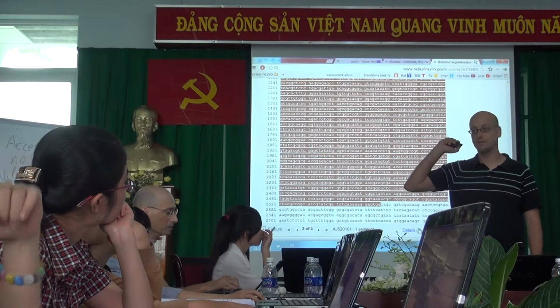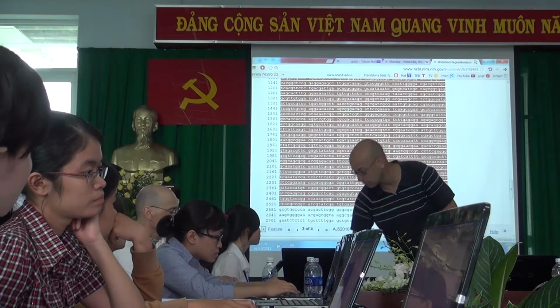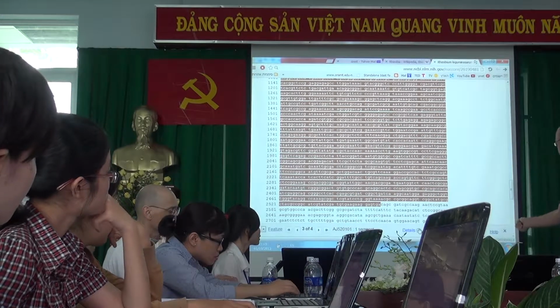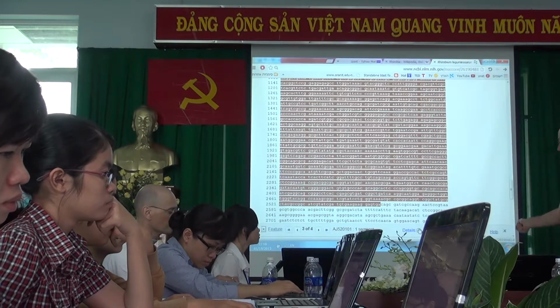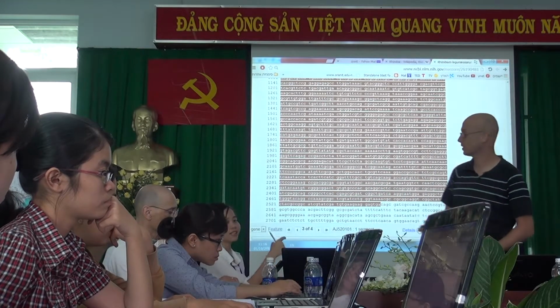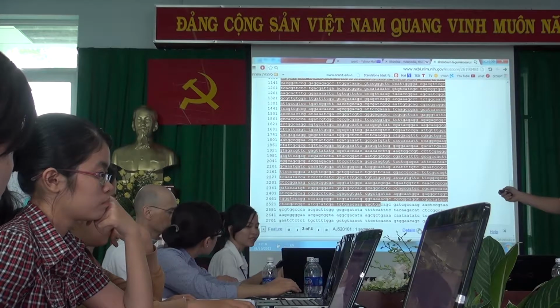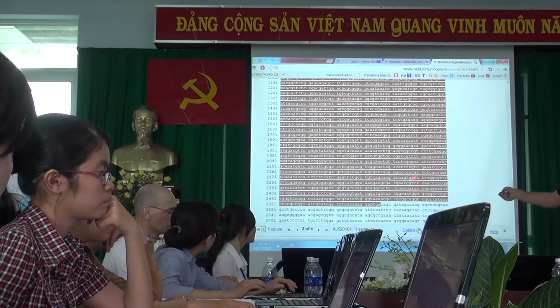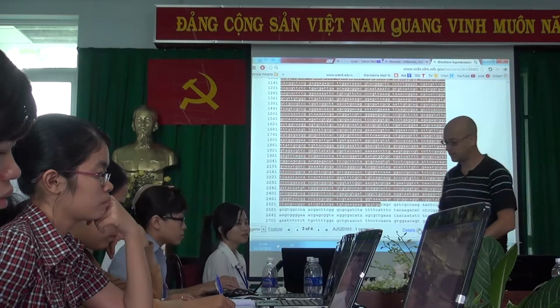Remember, FASTA. We want NIF-A as FASTA. So we go down here and we click on FASTA.